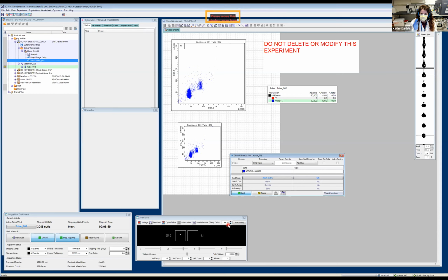So what I'm checking is a drop above and a drop below, and then checking the drop delay in the middle, as we expect it to be, and trying to get that as close as possible to 100. There will be some minor oscillations, but we expect to see that value as close as possible to 100, okay? I think at this point I'm running slightly over on time.